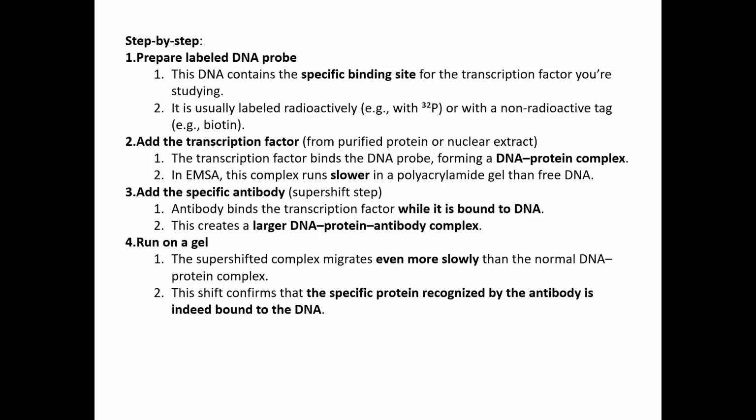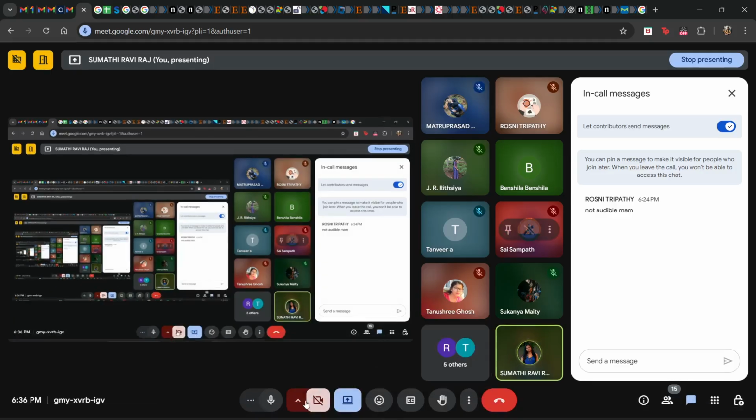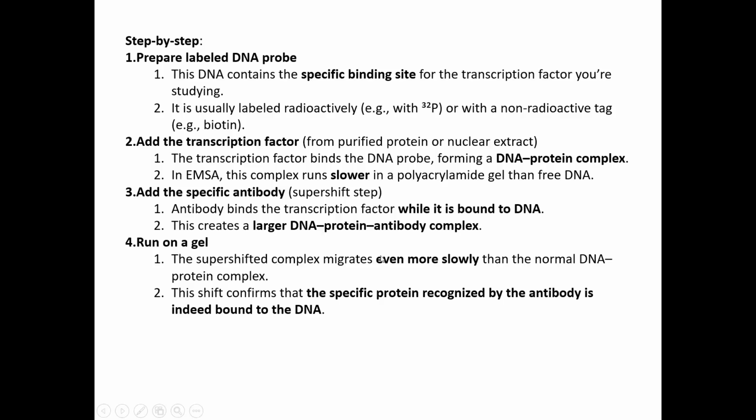So yeah, so these are now the steps for it. So we prepare and label the DNA probe first. So first is to prepare the labeled DNA probe.